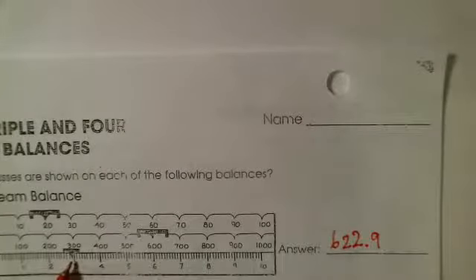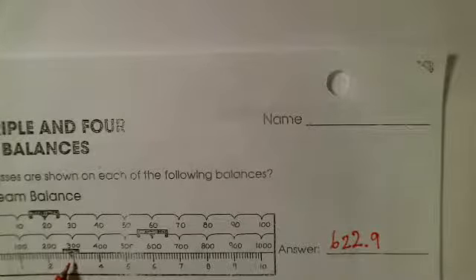Now, that little arrow, if you guys look carefully on your worksheet, you'll see it, is exactly on the 0.9. So the next spot that we estimate, I'll estimate as 0. Okay, and since we measure grams, it'll be g, grams.